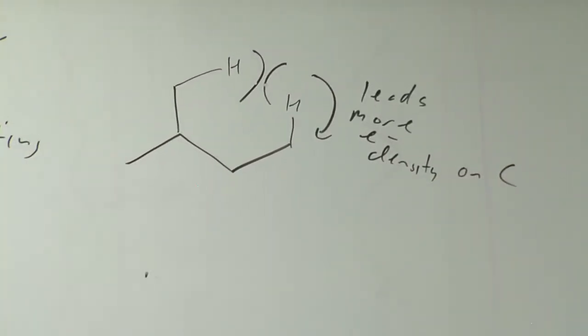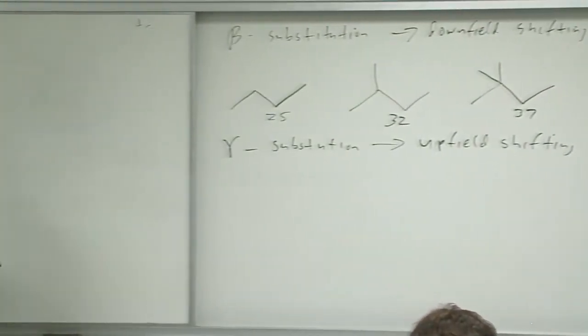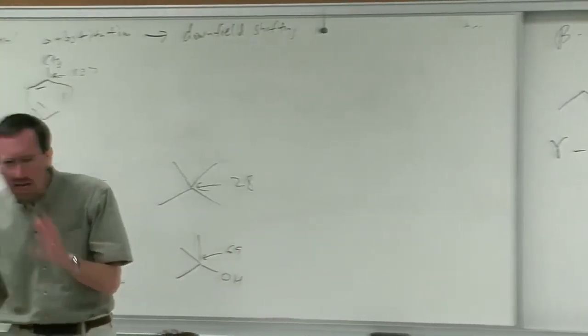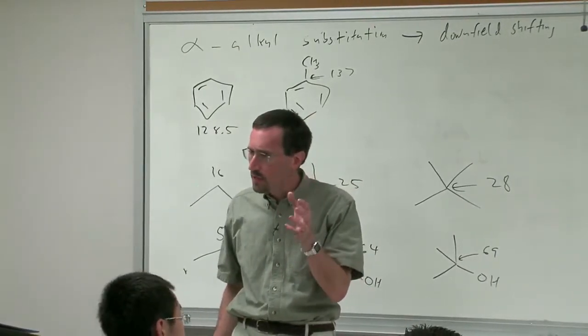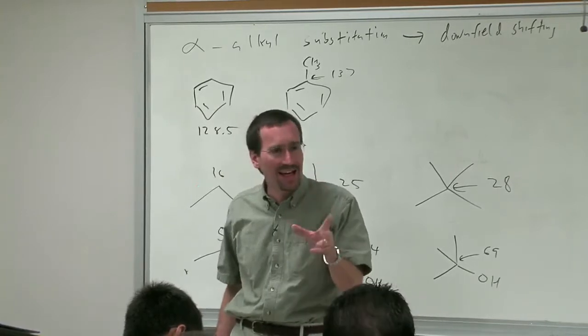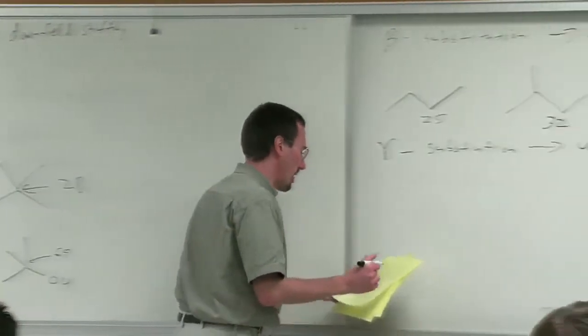In other words, electrons of the CH bond repelling electrons push electron density into the carbon. And since you don't want to have steric repulsion, this occurs most pronouncedly when the molecule cannot avoid steric repulsion. Let me show you what I mean.